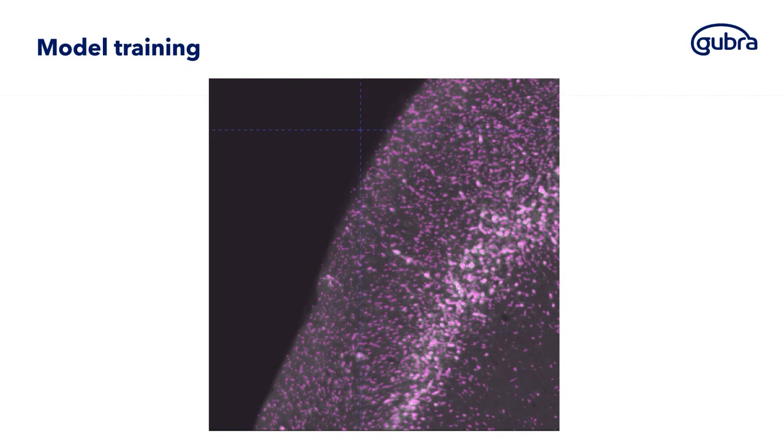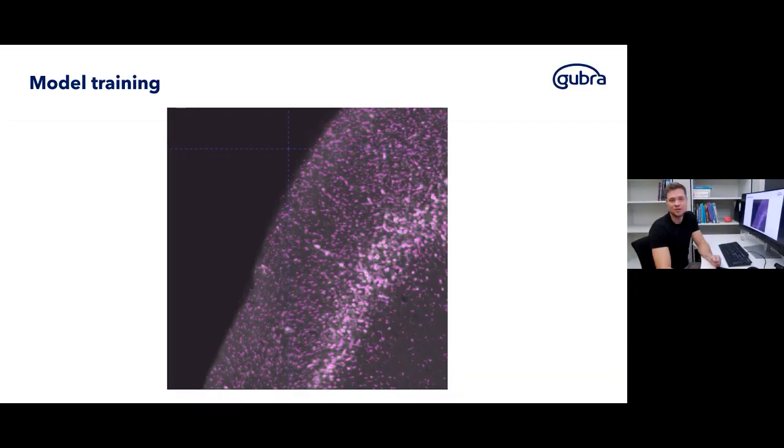So we're very happy. One thing to keep in mind now is that if we want to use this model in the future for studies alike, it's very tempting just to take this model and apply it again. And in some cases this will work, but it's also important to realize that in other cases the model performance might not be as good as when you initially trained it. And that can be due to many reasons.